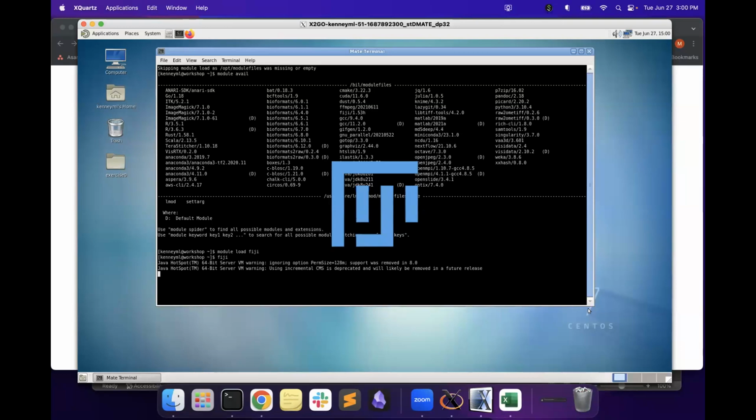But this is connected to the Brain Image Library file system. So you can go straight to your landing zone and see exactly what's there, and just point and click and open up any files that you have.